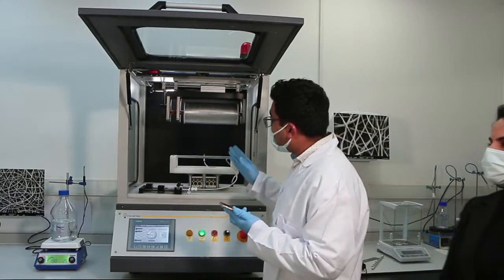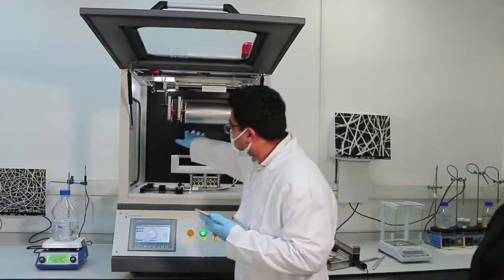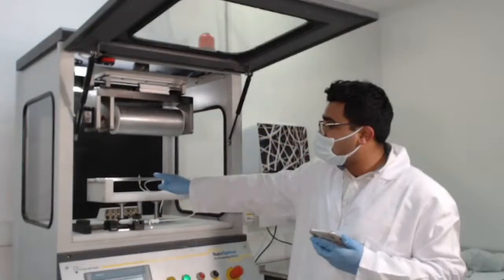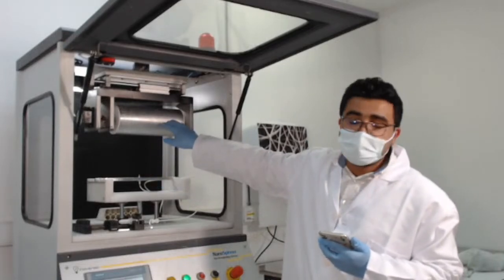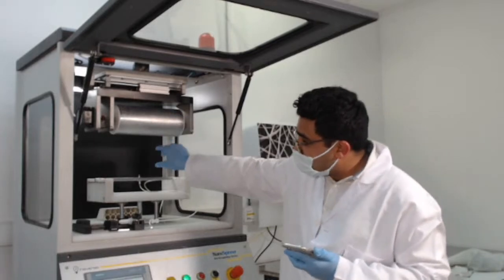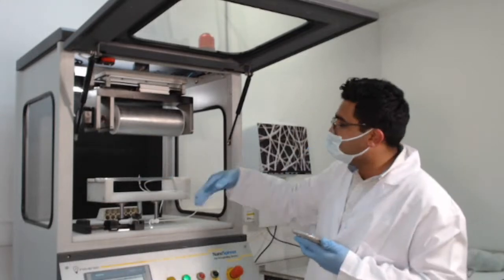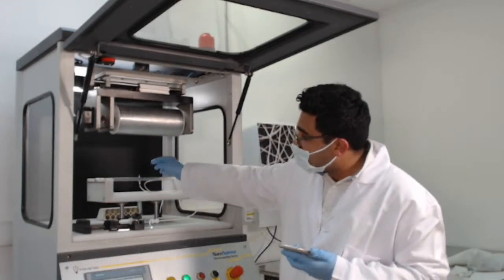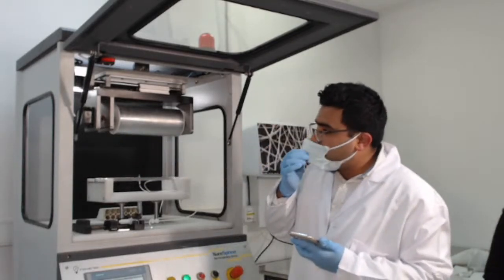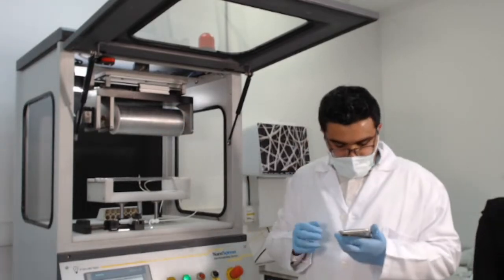It's important that the machine has proper grounding. If there is no grounding, you will find that the spun fibers start going everywhere, perhaps to the back of the machine. This is especially the case for the hybrid nozzle when the collector isn't grounded properly, or when the spinning distance is high. Because there are so many jets on the nozzle, there's a high chance that it could spin backwards. That's why you need to minimize the spinning distance. As long as the machine is grounded, you will not face such an issue.